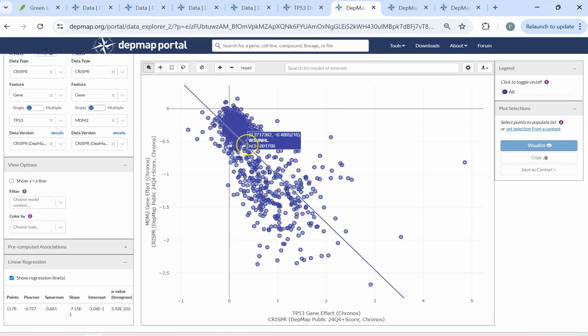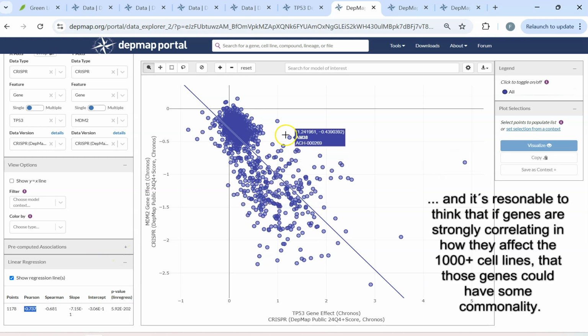And the correlation we're talking about is related to the correlation line here. And the numbers this correlation in the script are using is actually going to be exactly the Pearson, the same number as here. And that makes sense because these two things are based on the same data set, right? Although the calculations in the script are not the same calculations as here, but they generate the same data. So that's the basis for this. We're trying to find connections between genes, how they're behaving, right?